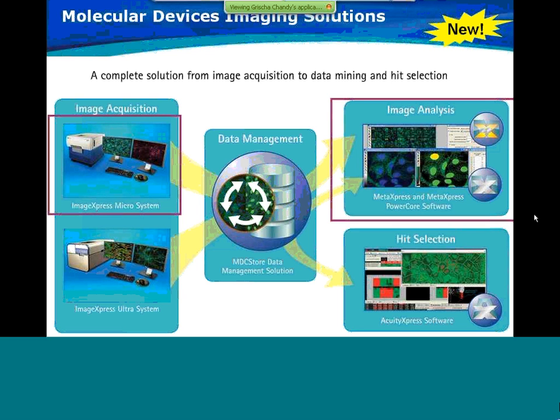People asked what magnifications the data was generated with. Most of the data, I believe, that Jayne collected was either at 10 or 20x. The system is capable of being configured with a very wide range of objectives from 1 to 100x. But for these assays, most of them were in the 10 to 20x range. And at the top of the Q&A session, we'll have Jayne comment on any deviations there.